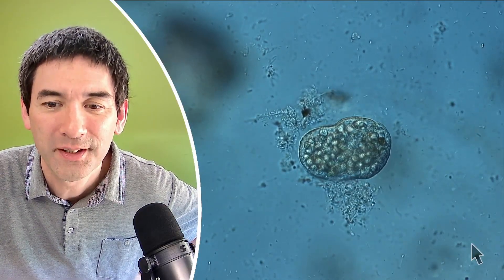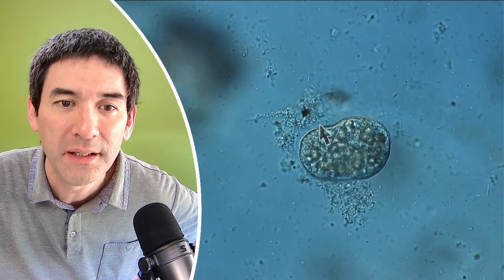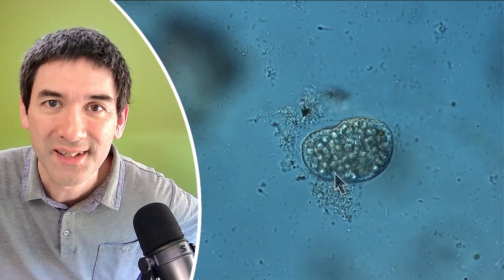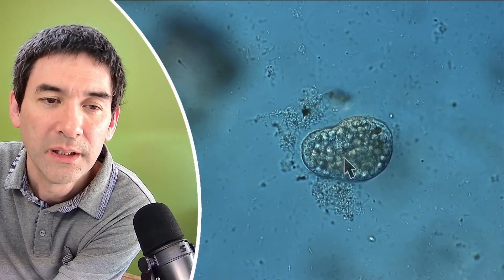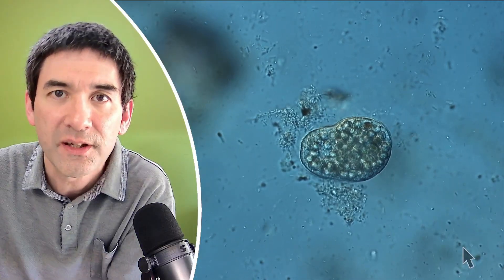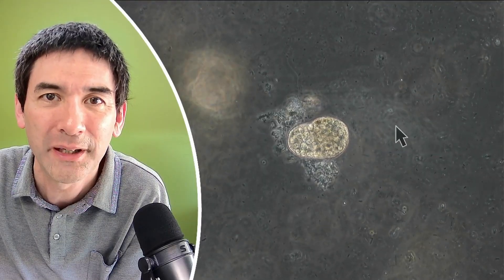This one here is quite a nice one — look at the stream of water it generates. The bacteria in the background are carried along by the water stream. There are tiny little structures on the surface called cilia that are beating and generating this water stream, and that's how it feeds — it sucks in particles, debris, and bacteria. When it's grown enough in size it's also going to start to divide. You can look at all of those cell organelles in there, possibly food vacuoles. Now in phase contrast, the cilia are beating so quickly you can't see them, but at least the bacteria in the background are a little bit better visible as they appear darker on a bright background.